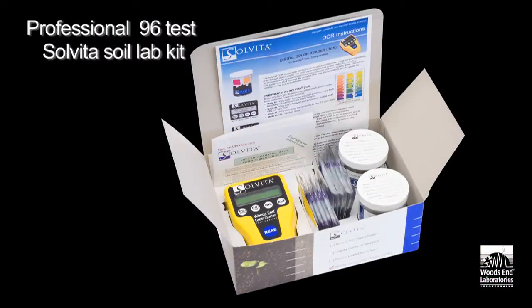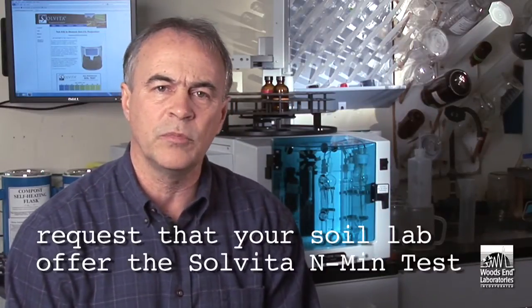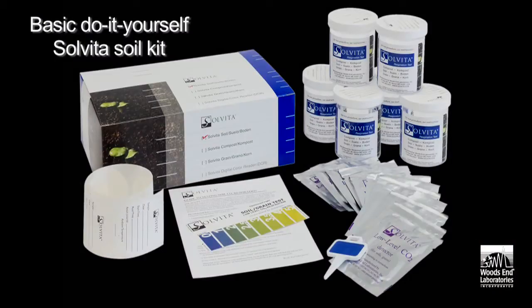It's time to take soil quality into account. The new Solvita test is especially designed for soil laboratories and is inexpensive and simple to perform. For growers interested in having this test performed, all you have to do is request that your regional soil lab adapt the procedure. For those who want to experience the test themselves in a simple do-it-yourself kit that does not require a laboratory, we have the basic Solvita soil test. All the necessary information is online at Solvita.com. Thank you for choosing Solvita.